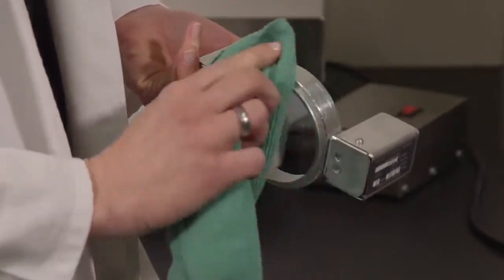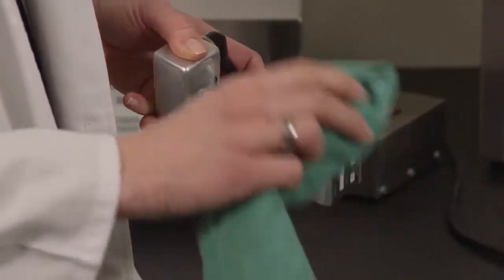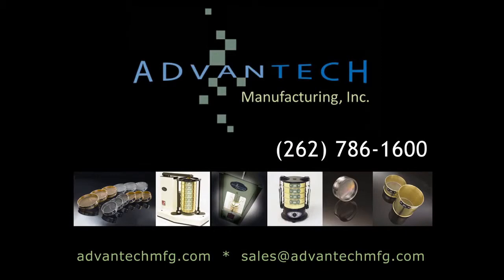Cleanup of the ring assembly only requires a damp, soft cloth. For additional Advantech manufacturing product and instructional videos, please visit our website at AdvantechMFG.com.